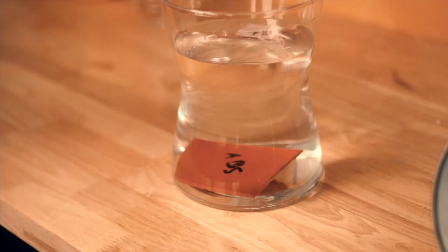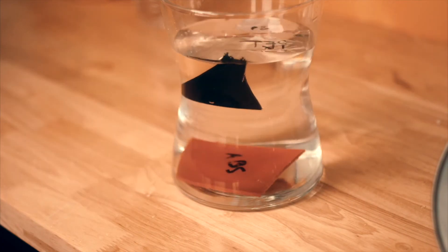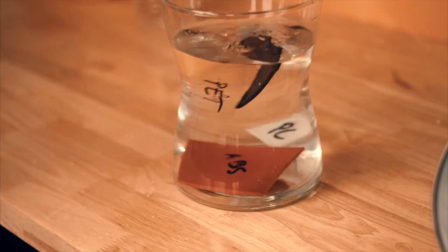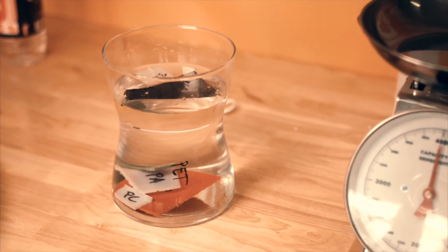You can try this for yourself with a simple water basin. More advanced sink float separation tanks can be used to actually separate different families of plastic.